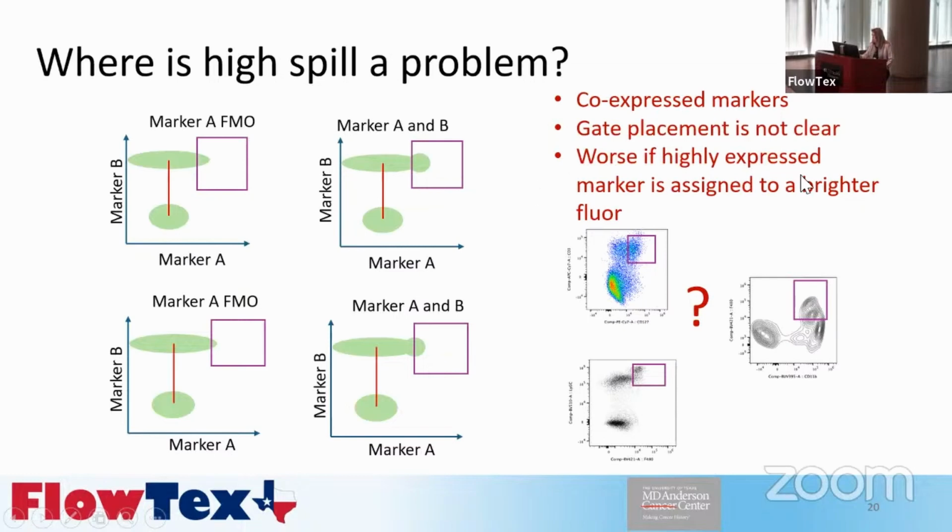This is going to get much worse if you put the highly expressed marker on a bright fluor and the low expressed marker on a dim fluor. So we always want to avoid that.